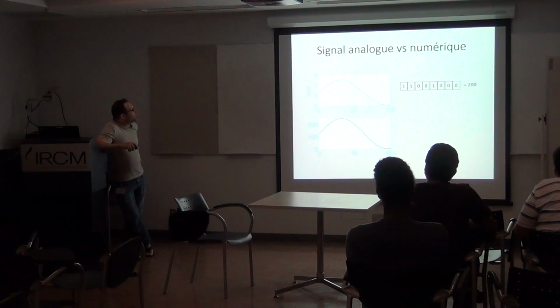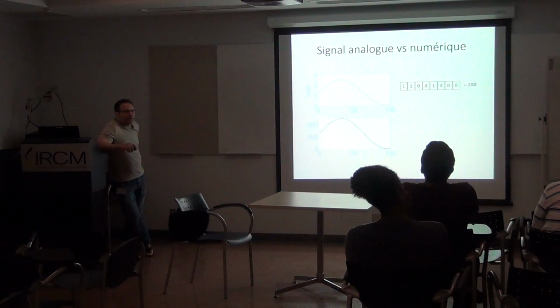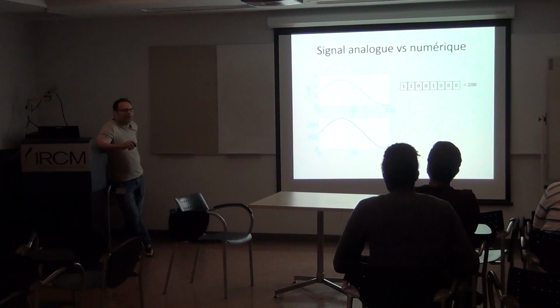Okay. So, signal analog versus numerical. It's good to distinguish this, even though everything these days is numeric.